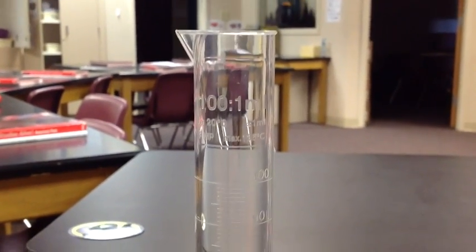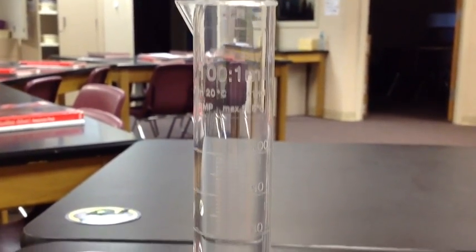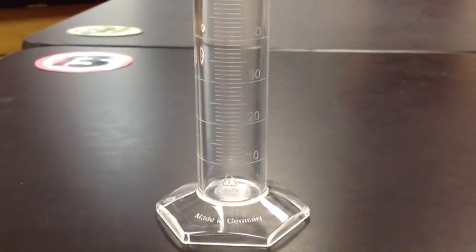This time we're going to learn how to use a graduated cylinder to find the volume of an irregular solid.